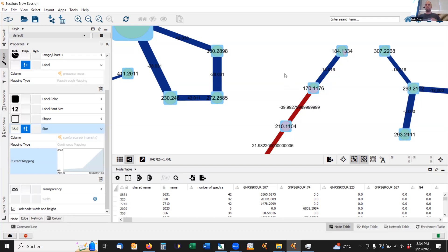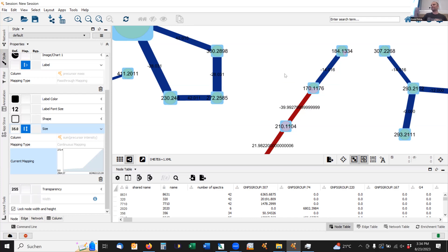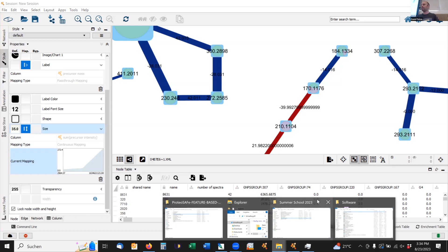What I wanted to do with you in the last couple of minutes is bring in that additional layer of annotation. Until a couple of weeks ago, it was pretty challenging to do that — you had to juggle the table and split column strings. But fortunately, thanks to Marcus, Fleming, Kai, and the others, they finally provided the feature number as an individual column.